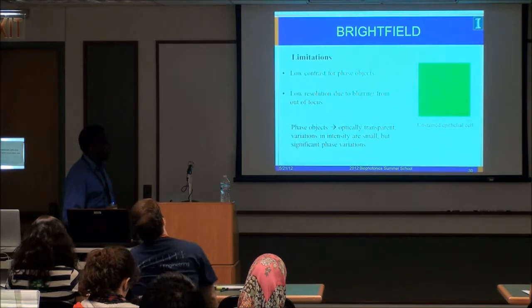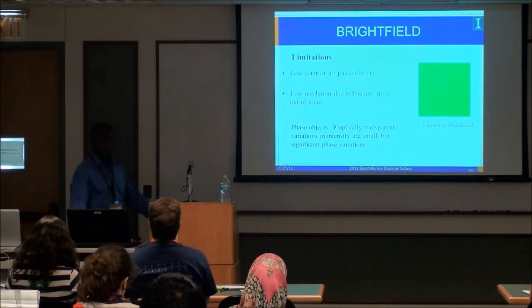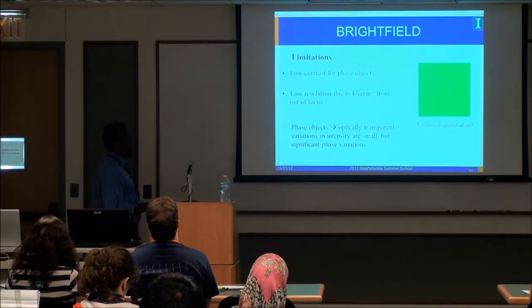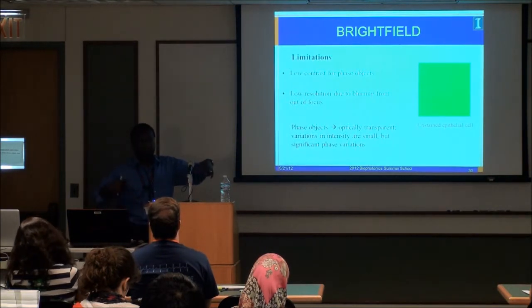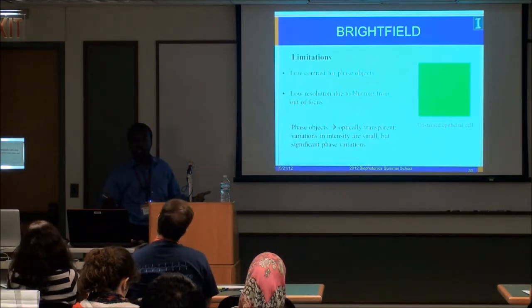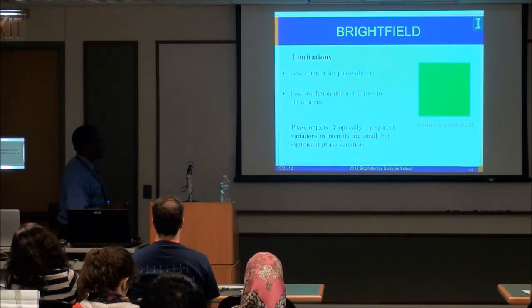Bright field is the standard, conventional, regular microscopy technique. Turn the light on, we image something. Okay, that's the bright field, right? And there are some nuances to this, whereby if the tissue is thick enough, even though it's unstained, because of multiple scattering events, depending on the wavelength of the light you're coming in with, you can actually get some contrast, for instance. But those are some details.